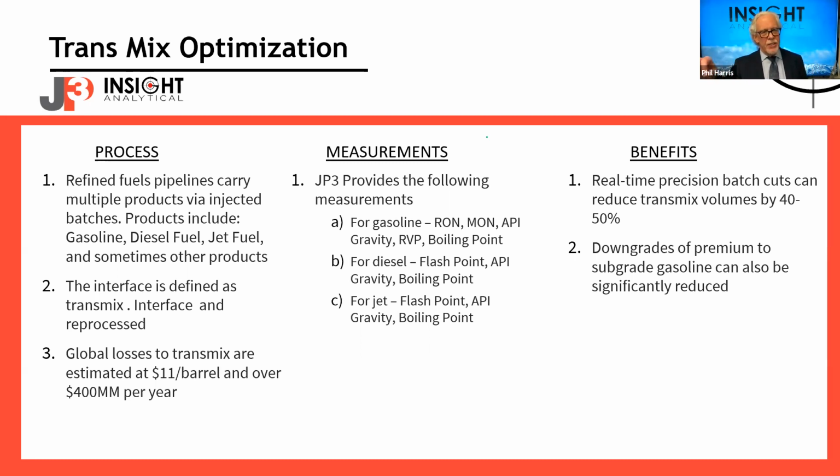So when we go into a new application, we can ask what infrared spectrum we are seeing from this guy's natural gas condensate. Let's compare it with our library of all the natural gas condensates we've seen and use data from other facilities to build an initial model, start moving that model forward and build out models from there. So typically, it depends on how many variables we're trying to measure and how much variability there is in the product. But Nate, what would you say? Most models have 40, 50 samples in them by the time they're done?